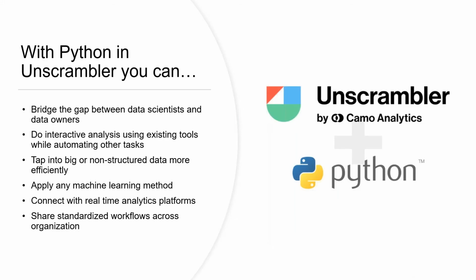So what's the advantage of this? One big advantage, of course, is that you can bridge the gap between data scientists and data owners, such as yourself. If you have some tool that you want to use, some new method, it is possible for you to analyze your data with that method by yourself. That means that you no longer rely on an external person, perhaps with less domain knowledge, to analyze the results of your data.